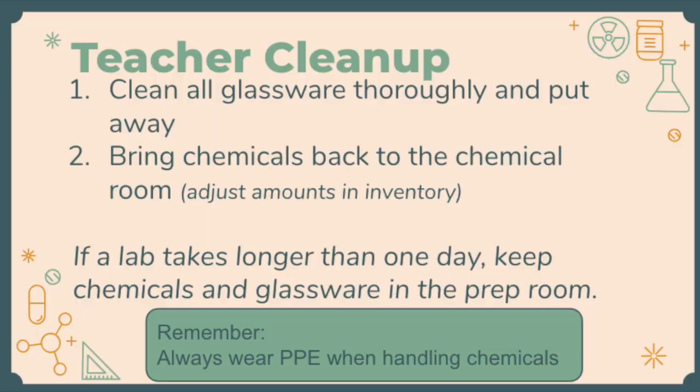Teacher cleanup procedure. Clean all glassware thoroughly and put away. Bring chemicals back to the chemical room. Adjust the amounts accordingly if you didn't do that before. And if a lab takes longer than 1 day, keep chemicals and glassware in the prep room. Remember, always wear PPE when handling chemicals.